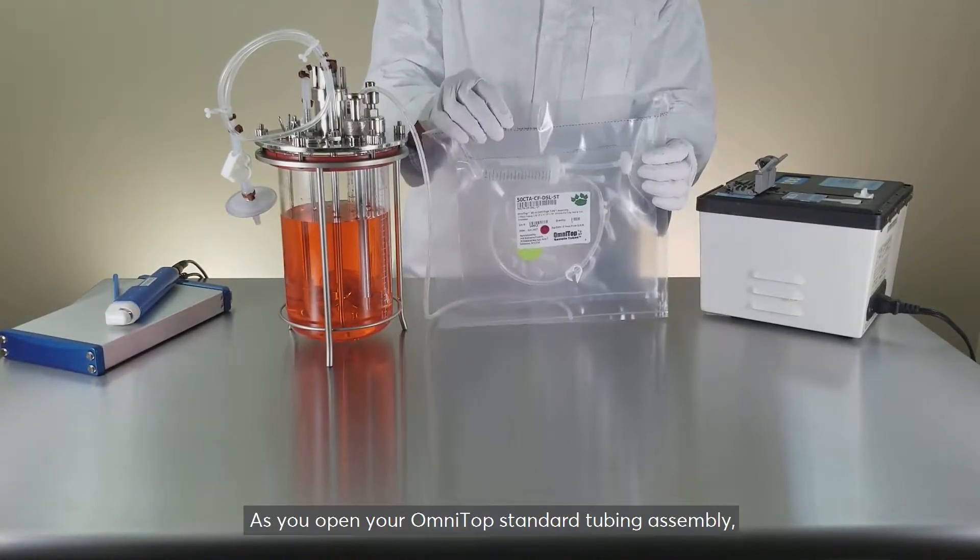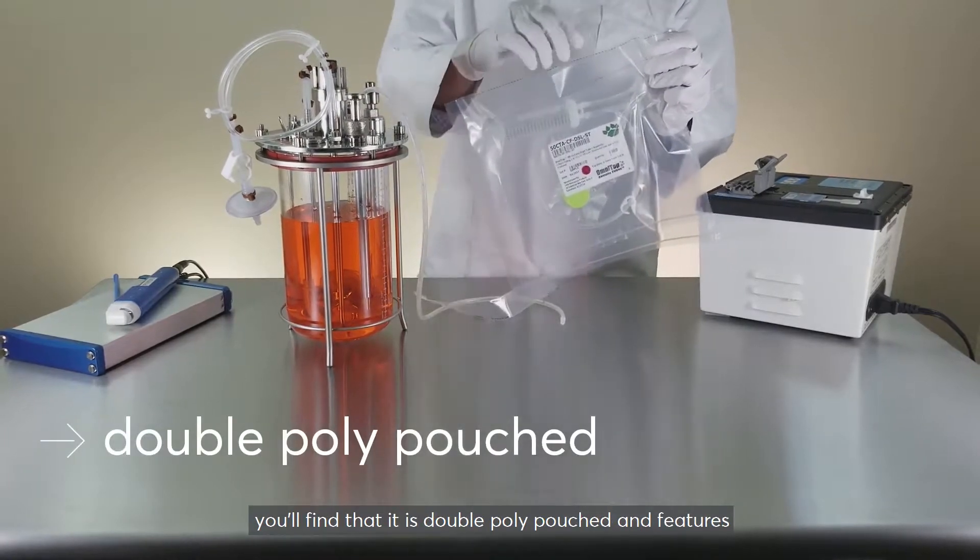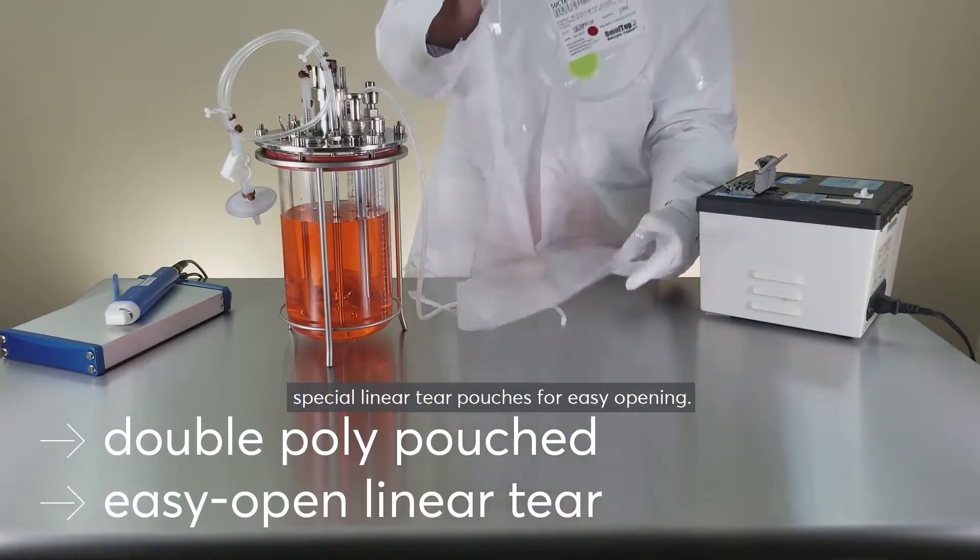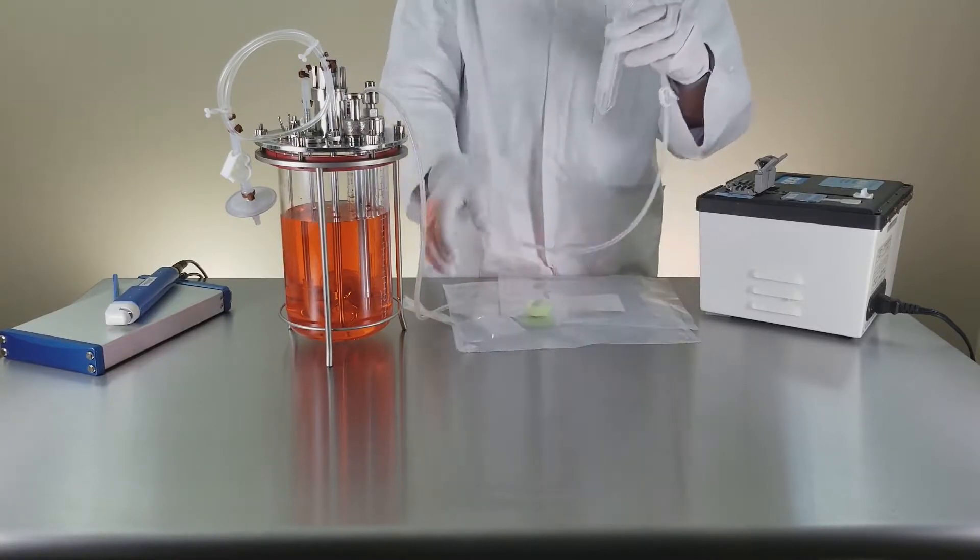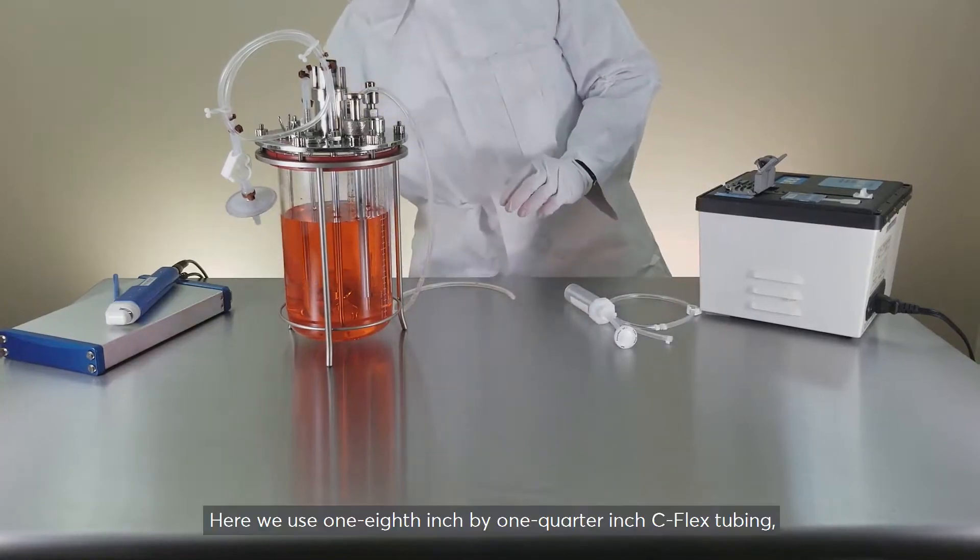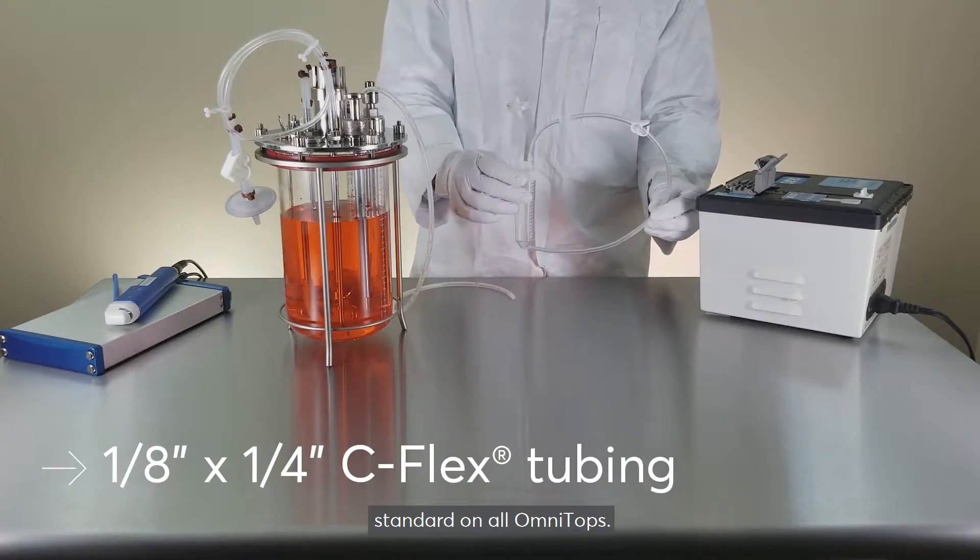As you open your OmniTop standard tubing assembly, you'll find that it is double poly pouched and features special linear tear pouches for easy opening. Here we use one-eighth inch by one-quarter inch C-flex tubing standard on all OmniTops.